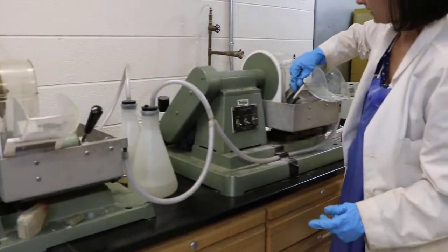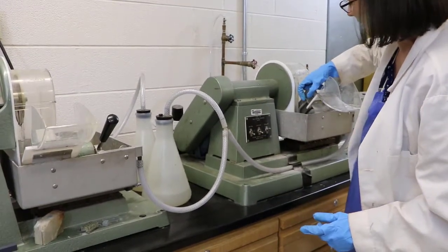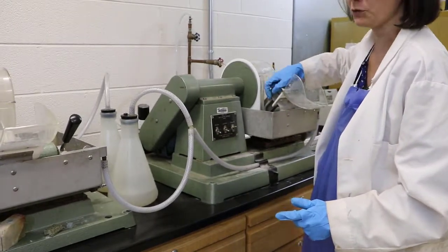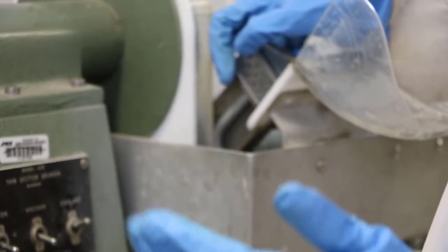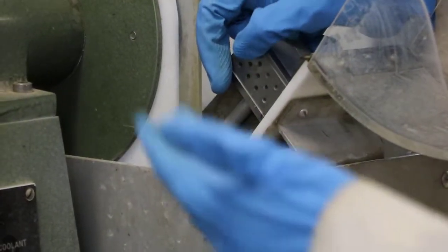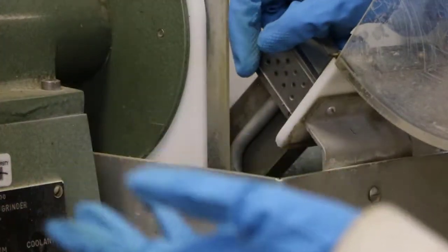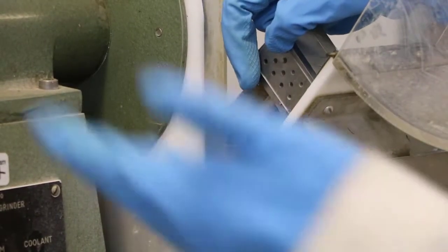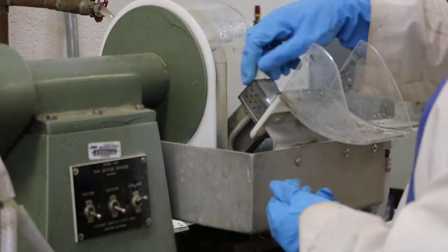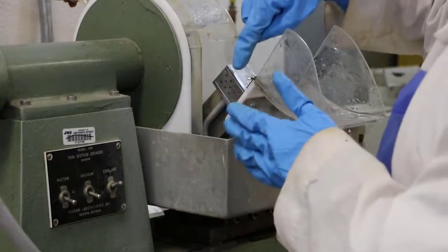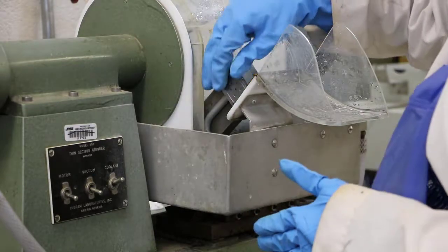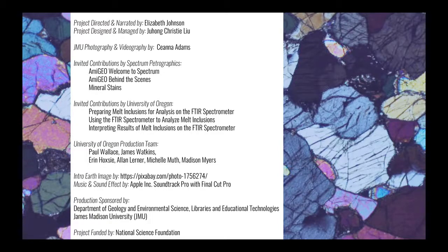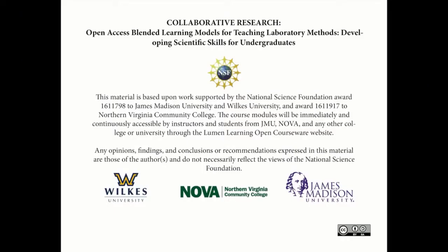And then the suction will work to keep your sample attached to this jig. If you can move your slide around, that means that the vacuum suction is not working. And you need to figure out what's wrong before you start to cut your sample, because if it's not attached well then it will fall off while you're trying to cut or grind the sample. And that doesn't usually end very well. So that's a good way of checking. And if it is loose, you may want to check the back of your thin section slide because a lot of times the problem is that there's either some grit or material here that's keeping the surface from being flat, or else you actually have glue or some other imperfection on the back of your slide that's keeping it from making good flat contact. And it's preventing the vacuum from making complete suction there.